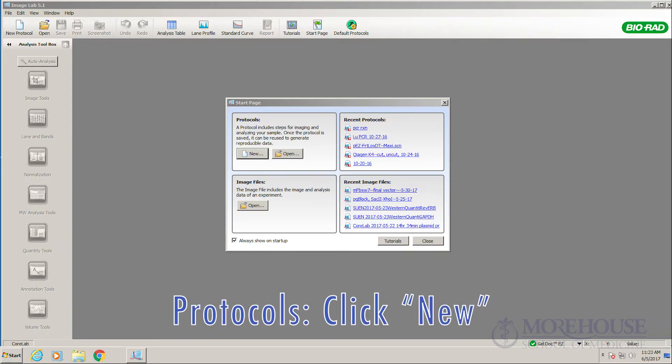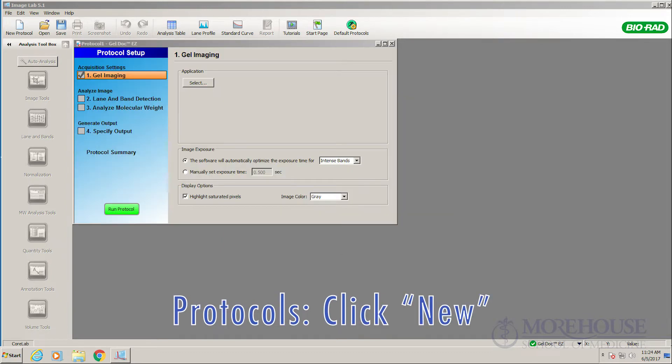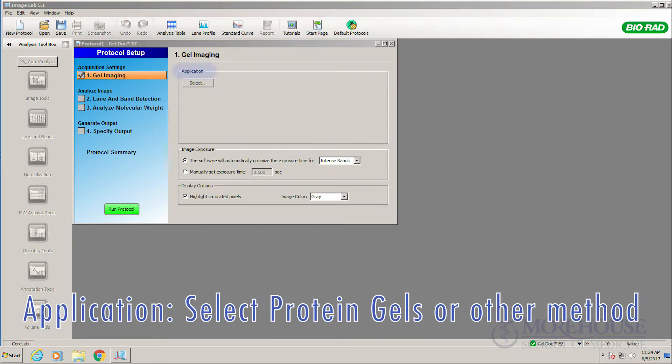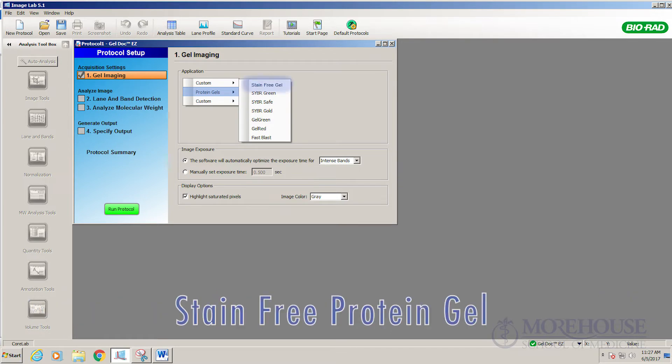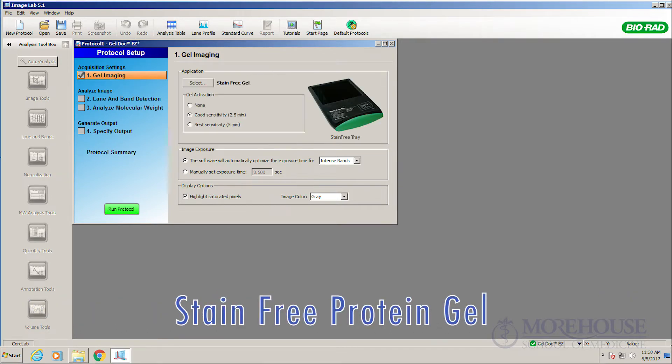Protocols. Click New. Application. Select protein gels or other method. Stain free protein gel.